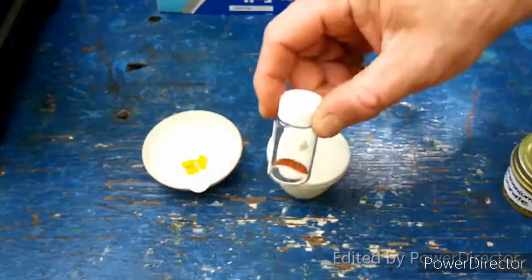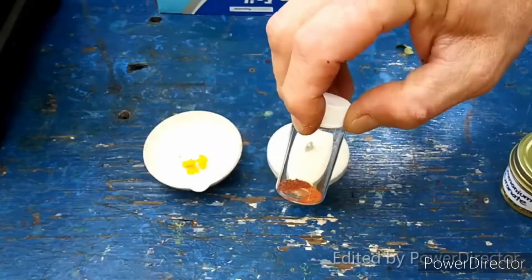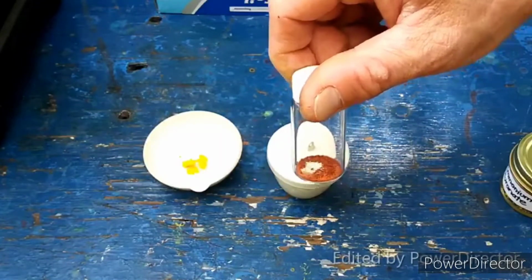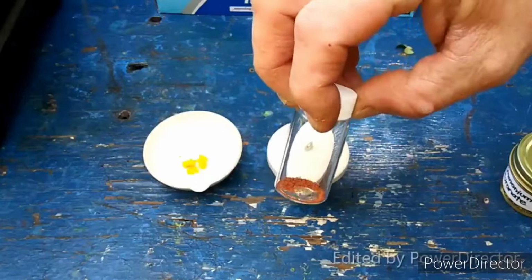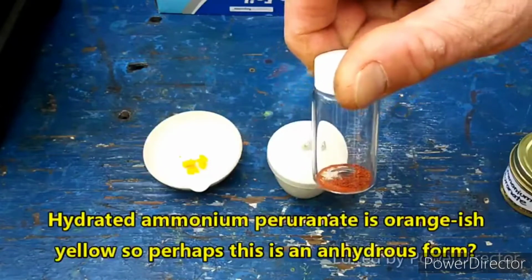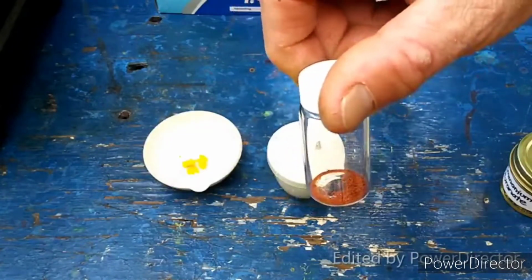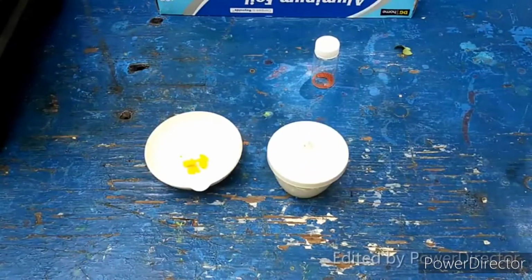I also wanted to show you guys this. This is what I got when I tried to make and filter and dry ammonium peruranate. You saw where I made it in the last video. All I did was make a slightly bigger batch of it, filter it, and dry it in the desiccator. It turned reddish. I'm not sure if that's good or bad. It seemed to have only happened to that portion of the solid that completely dried out. So maybe this is just an anhydrous form of it? I don't really know. It's very pretty though. It's going on the shelf as ammonium peruranate either way until I find out otherwise.